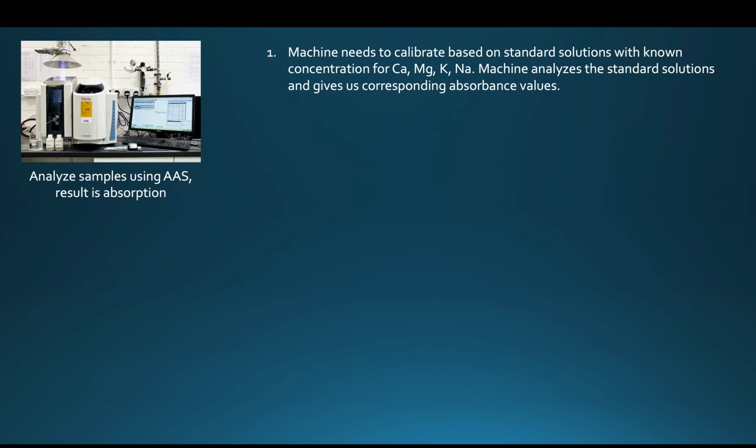So this machine was calibrated. In the case of section 2, we did this all together. The other section, we just did one of these curves to fill out the potassium that didn't quite work in the first section. But this is where we were taking known concentrations that were made by Teresita Ono, one of the wonderful scientists in our department here, and running them against the absorption or emission values for the corresponding base cations.